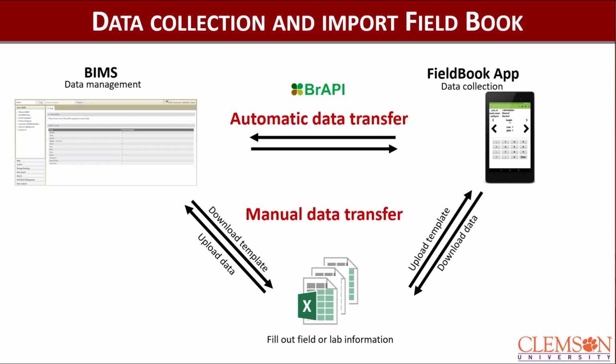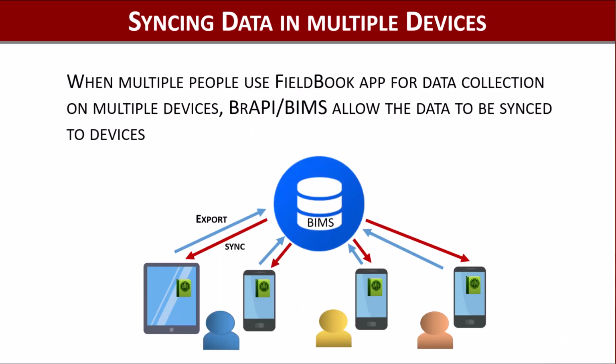We use the manual data transfer or manual templates for uploading the lab data into BIMS, and then we use BIMS for data management, search, and any routine applications in the field. So the biggest improvement in my program with using the Fieldbook and the BIMS is the ability to sync the data on individual gadgets that are using the Fieldbook to collect the data.